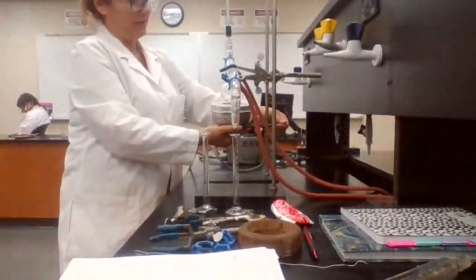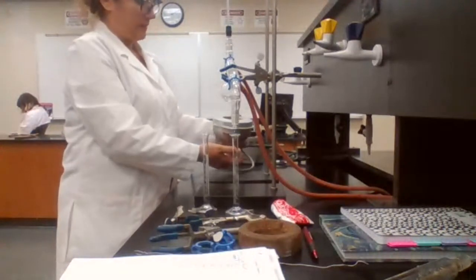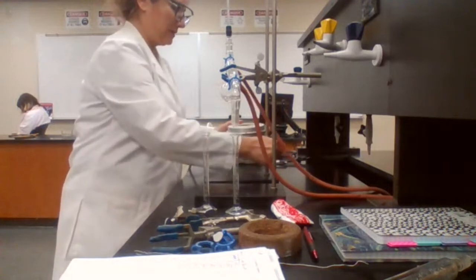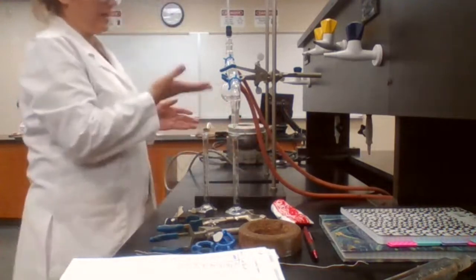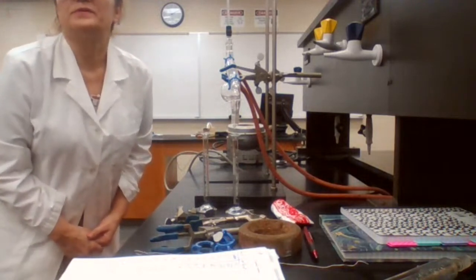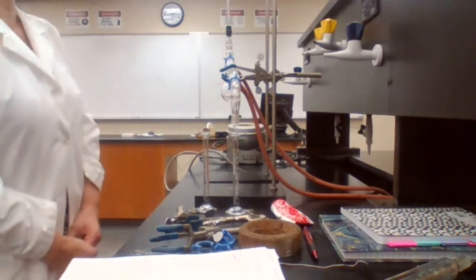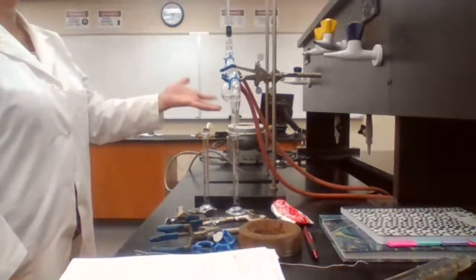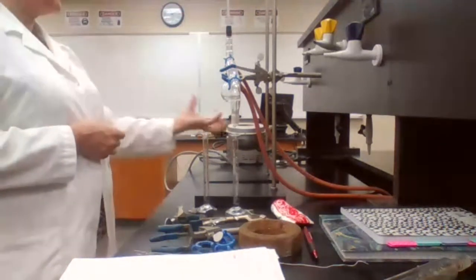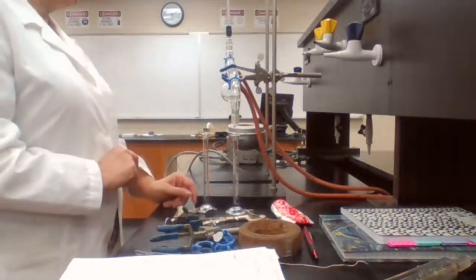I lower the heating mantle. And I wait, and sometimes you can move it around so it's not heating indirectly. Even up to 16 milliliter, it's actually now dropping down because I dropped the heat. You collected 17 milliliter, but that value is not valid because I removed the heat. So 16 milliliter, that's where you stop.